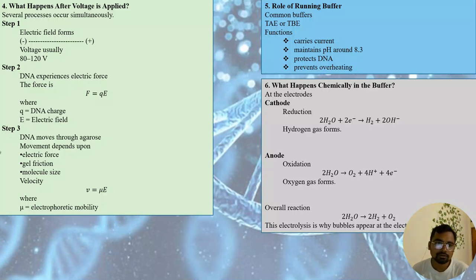DNA moves under the electrostatic force and gel friction, which depend on size and velocity.